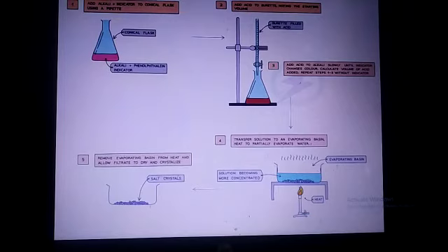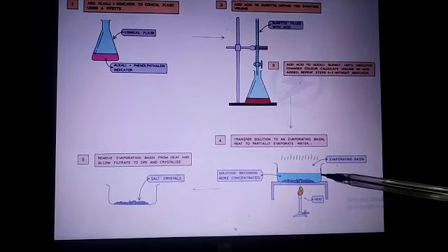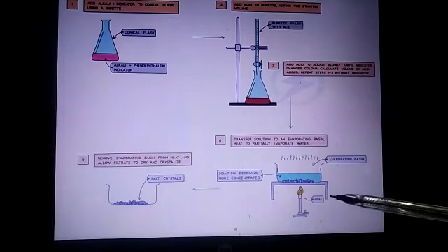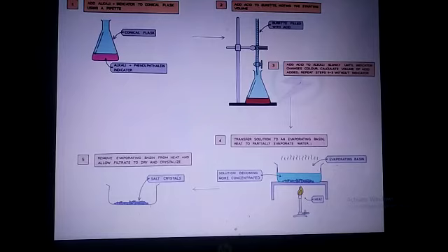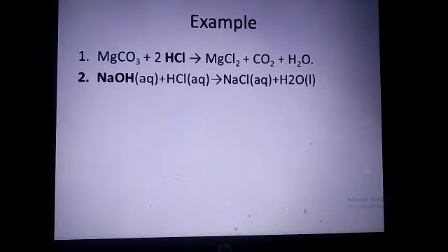After heating, remove the evaporating basin from heat and allow the filtrate to dry and crystallize. We will get crystals of the soluble salt by this method in which both reactants are soluble - the base or soluble carbonate.